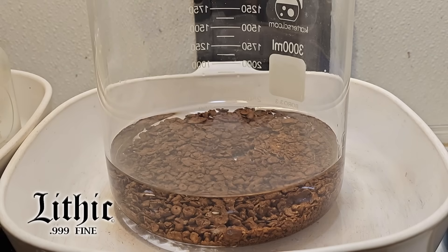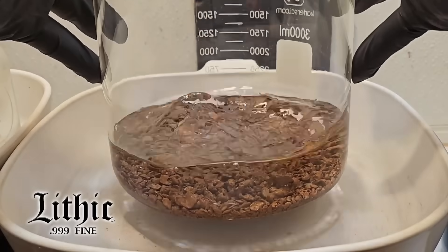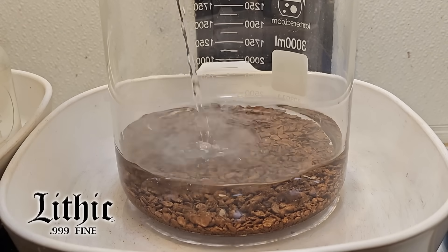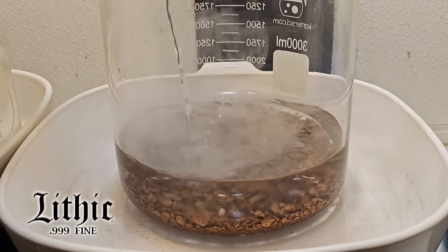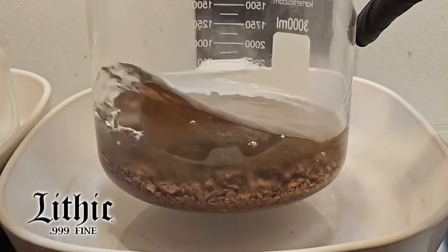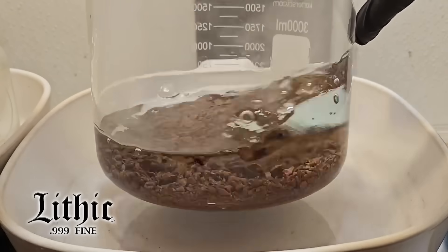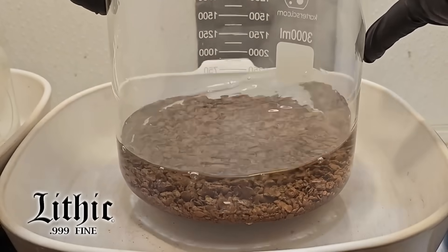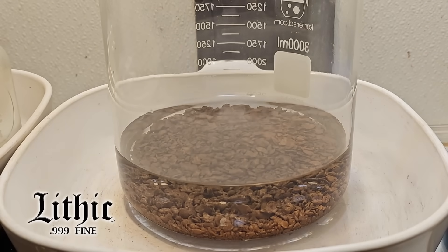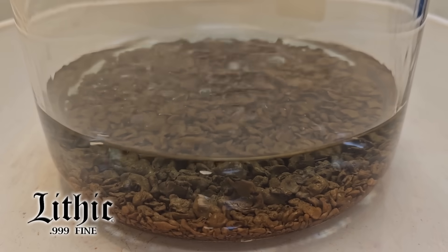Here's some more distilled water — shake it around — and I'll add a bit more nitric acid and give this another round. Give it a good swirl so it's nice and mixed up, and back on the heat it goes. I'll get that up to a boil and see if we get any color to come out.